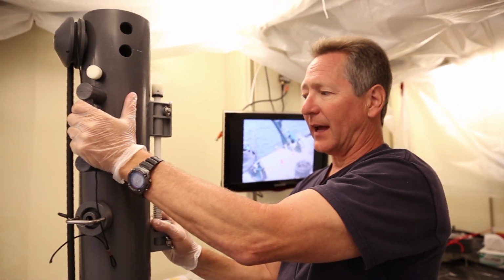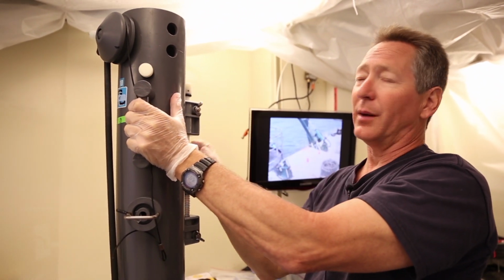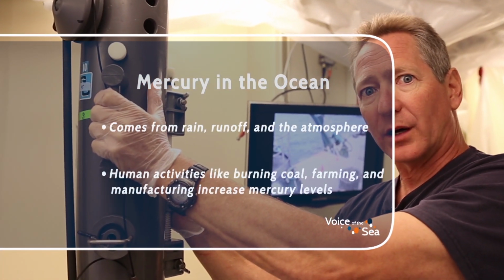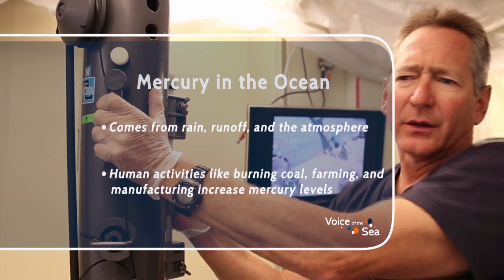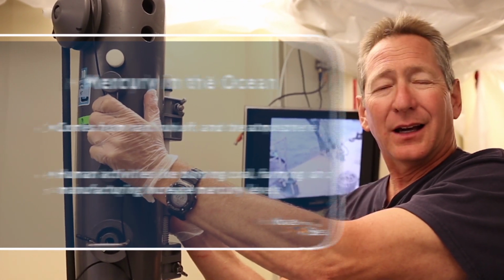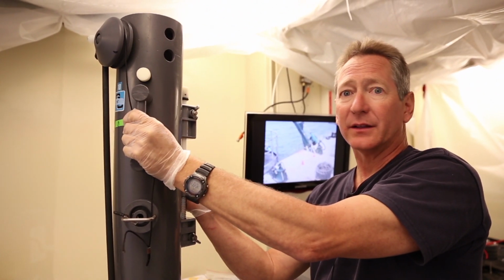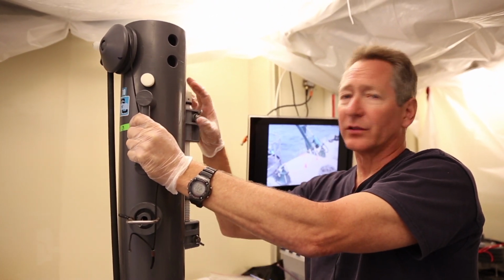GoFlow bottle into the laboratory and sample it under these clean conditions that we've created with our trace metal free bubble. We're sampling mercury in this case, and it's mercury that's dissolved in seawater. We're interested in the concentration of mercury as a function of depth because we've seen mercury changes in fish that feed at different depths within the ocean. And we want to know if that's what's driving the concentration gradient in fish, whether it's a concentration gradient in dissolved mercury.